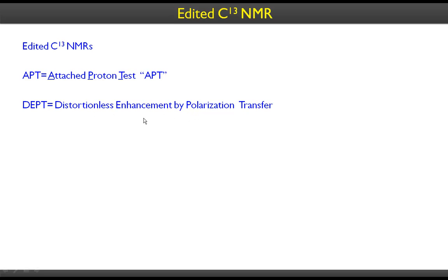This is pretty technical jargon. At your level, at undergrad level, I don't think you need to know all this terminology, but if you are interested, we do teach an advanced spectroscopy class in our department, so you can take that class. And again, we have different types of DEPTs depending upon the processing. You remember, this is editing. It's like shooting your movie and you sit down and edit as to what you need. Probably you can delete some information, or you can add some information, or you can modify some information using the technology. The same is true here.